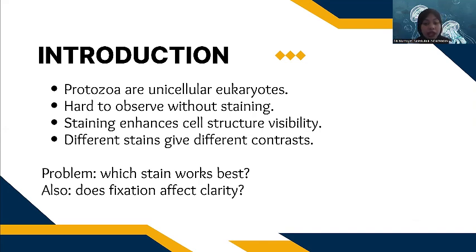In this practicum, our group investigated which staining reagent provides the best visibility for protozoa and whether the fixation process using methanol influences the staining outcome. Understanding this variable is important not only for academic training but also for real-world diagnostic accuracy in parasitology and microbiology.